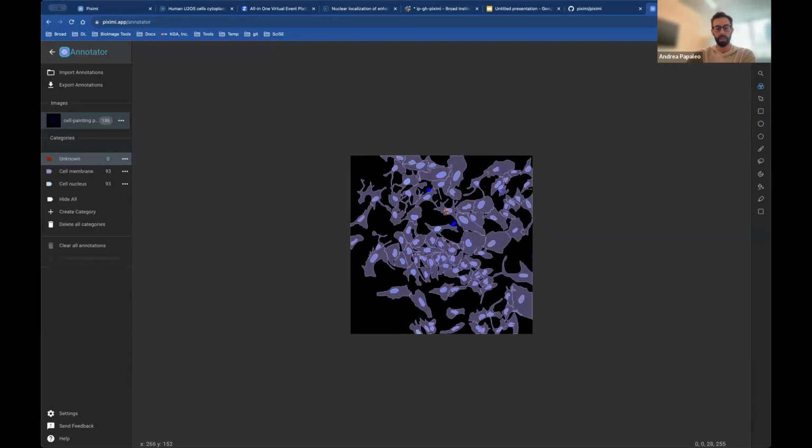But if you have a Z-stack, then you can annotate the different planes of the image on different Z-stacks, and those annotations will be on those specific planes. But as for channels, the annotations aren't specific to channel 1, channel 2, or channel 3. They're just specific to the image and the plane.